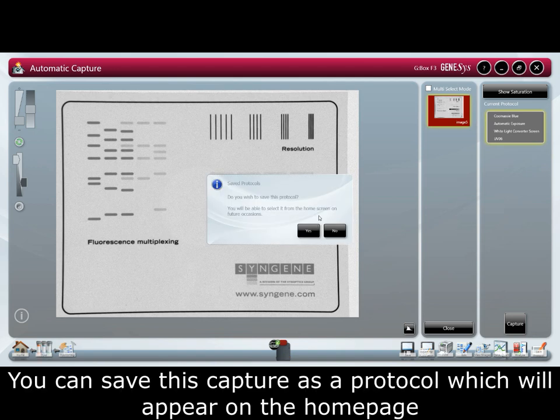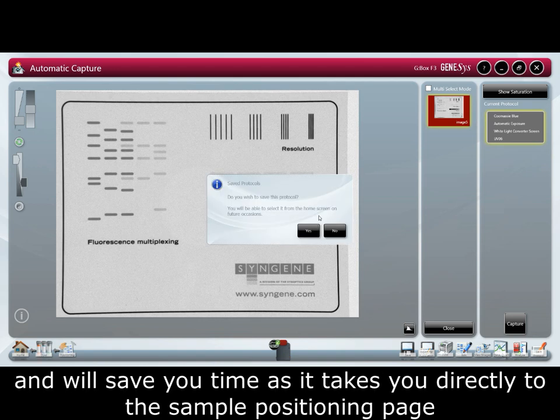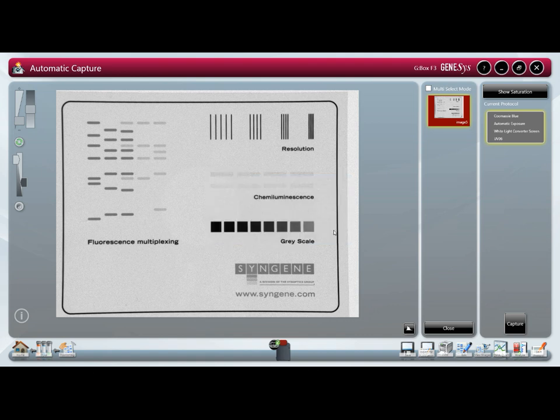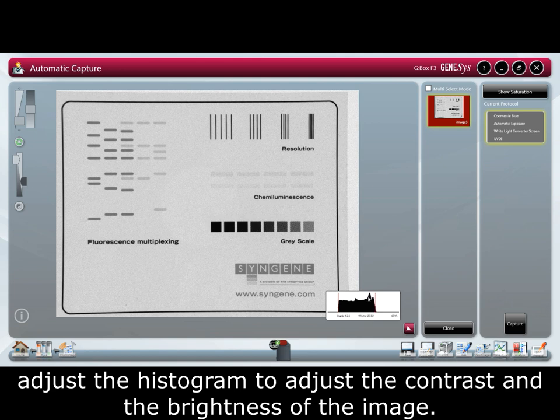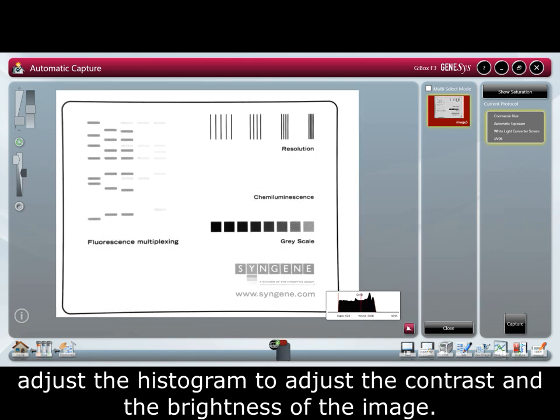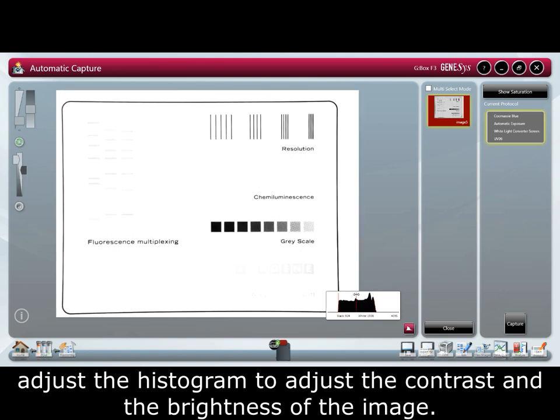You can save this capture as a protocol, which will appear on the home page and will save you time as it takes you directly to the sample positioning page. The histogram shows the number of grayscale levels captured by the camera. Adjust the histogram to adjust the contrast and brightness of the image.